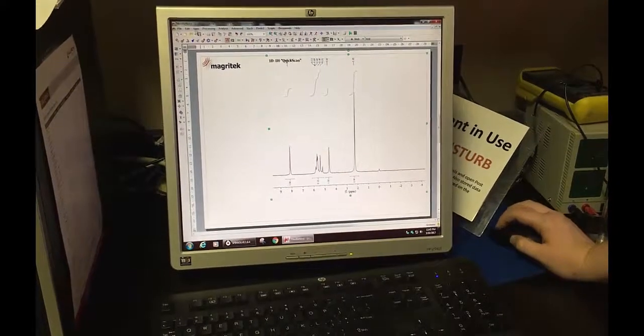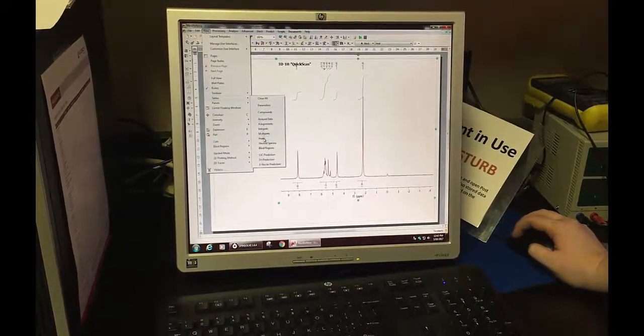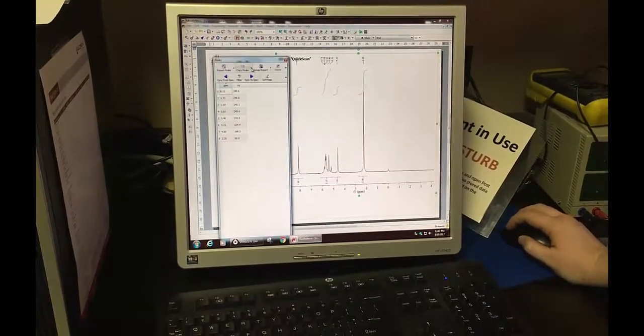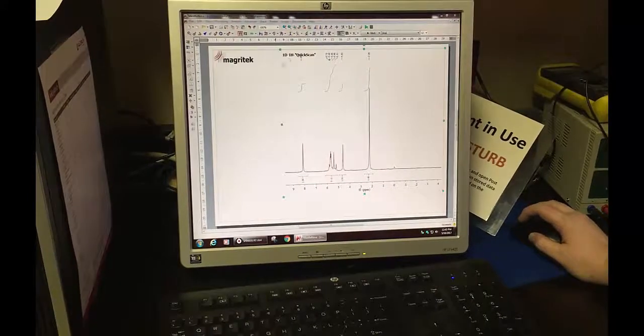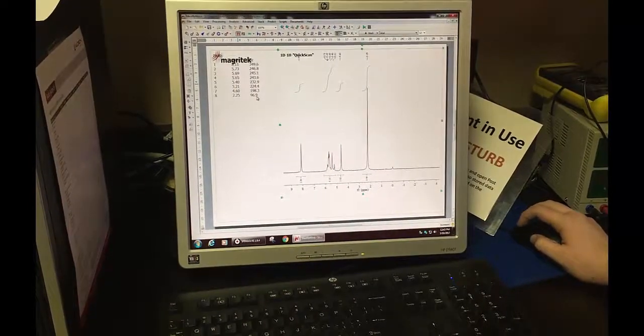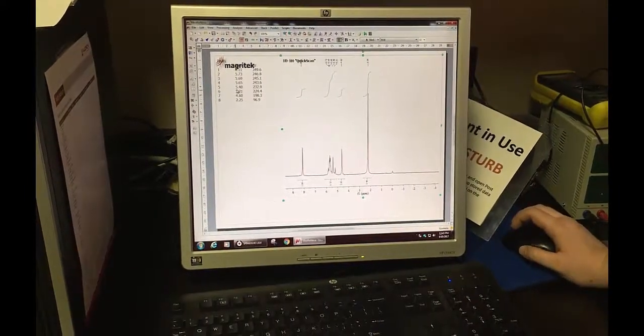So after you've done that, you go to View, go down to Tables, and Peaks. Then you're going to come up here and copy the table and paste it onto your spectra. So now you'll have a summary of all the peaks in your table, and then you can save that and print it.